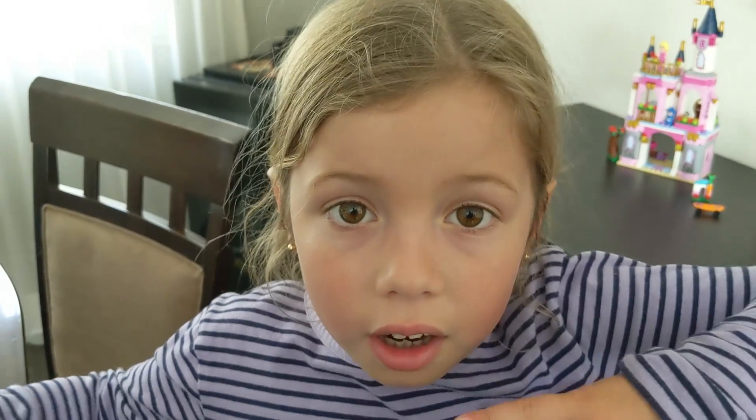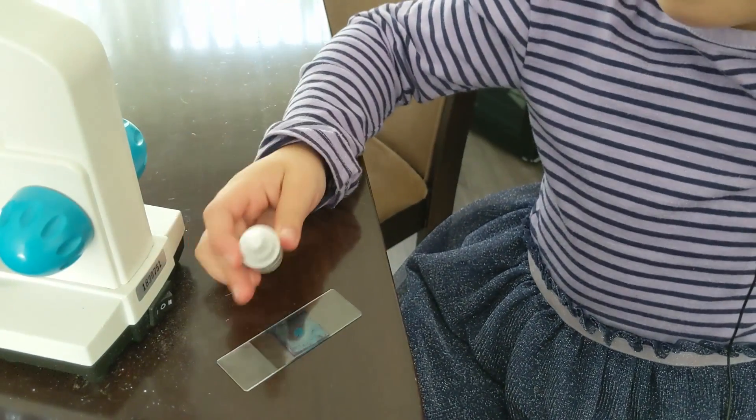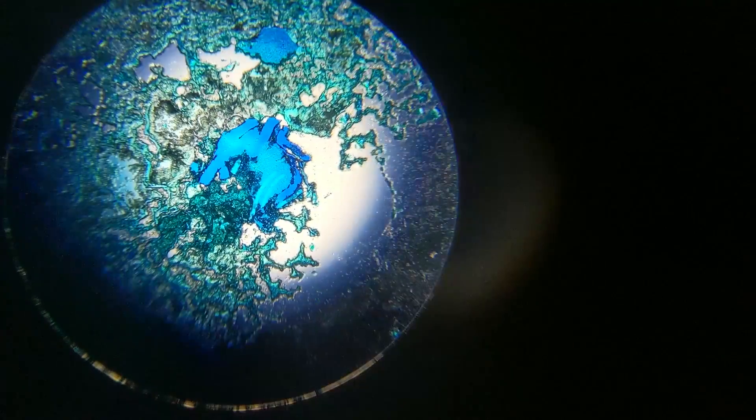I took the yuck off my teeth, I put it on the slide, and I add the dye. We found some actual bacteria — see that dark blue stuff? This is how they look magnifying a little better.